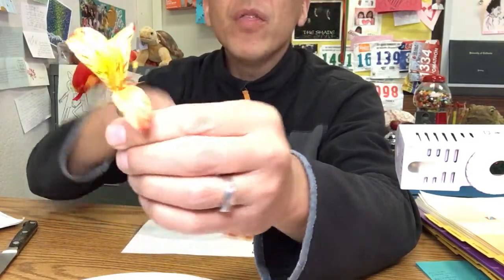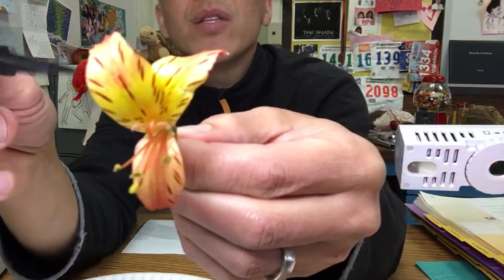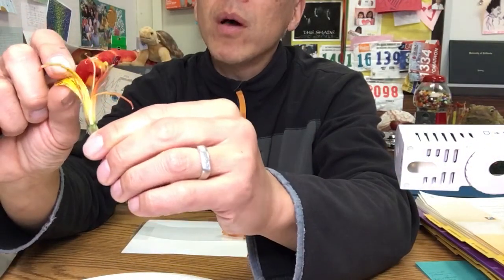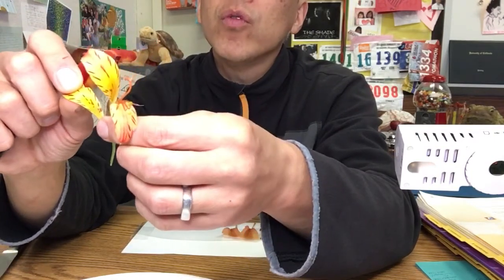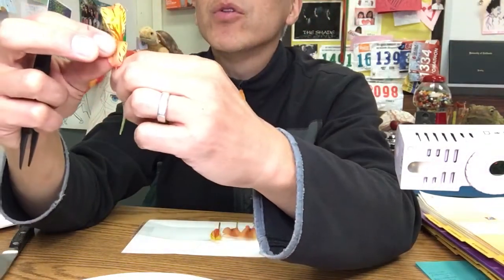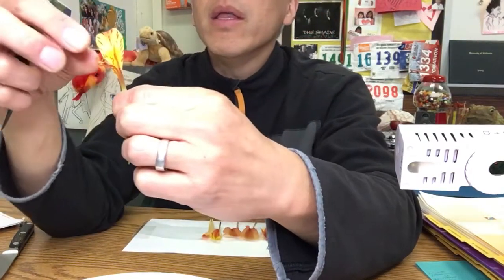And then I have the petals. And the petals have these markings on them. Anyone have any idea what those markings are from? I'm going to take those off as well. Uh-oh. Oof. Not what I wanted. And there's one. Here's two. And here's a third.